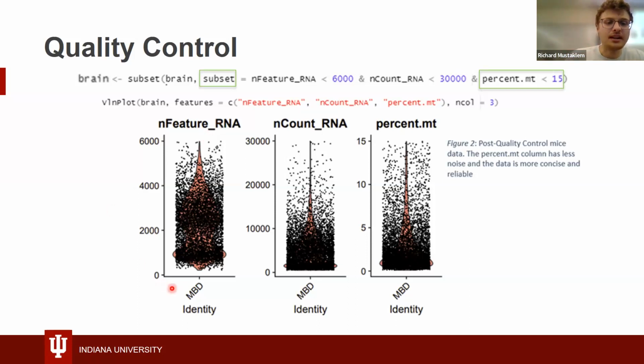And you can see down here, this all came from the mouse brain data set. This is going back to integration. If you compare multiple samples together, you can see that my first mouse was clean, but my second mouse wasn't. In this case it doesn't matter because we're only using the same data. But in some cases, you might need to look into why my first mouse was more dirty than the other one.